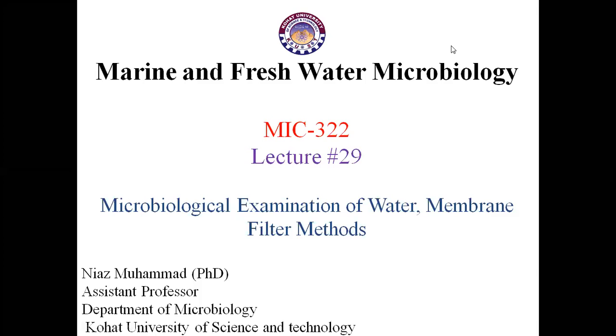Well, we are again here with marine and freshwater microbiology. As you remember, we were talking about microbial examination of water, and we will talk today about the membrane filter method.